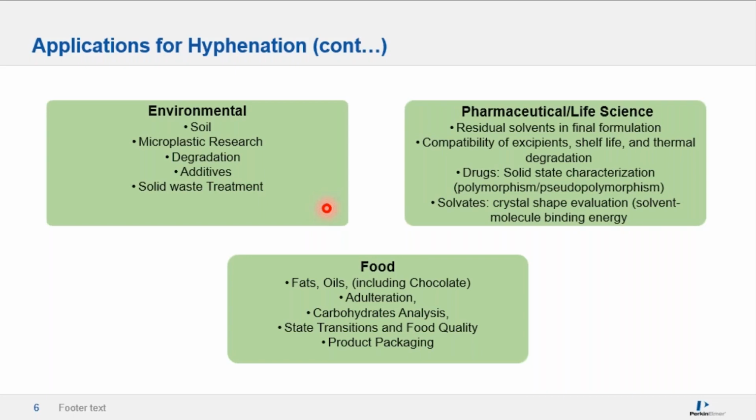An important application for pharmaceuticals is measuring residual solvents that may be in pharmaceutical products derived from the manufacturing process. So we want to make sure that all of these volatile compounds are not present in the final product. And there's a host of different other applications as well.